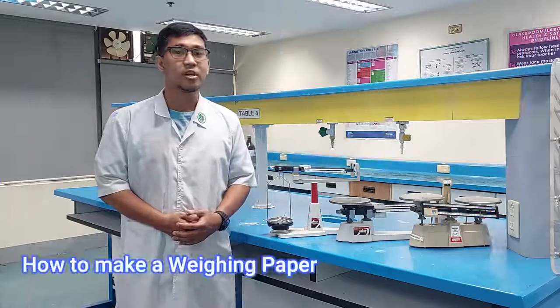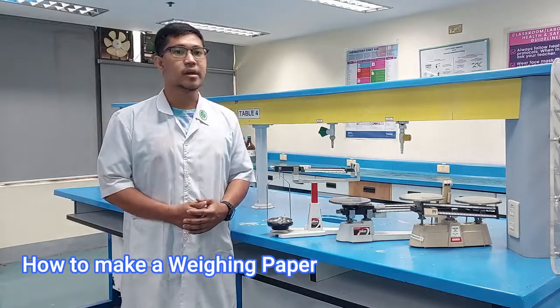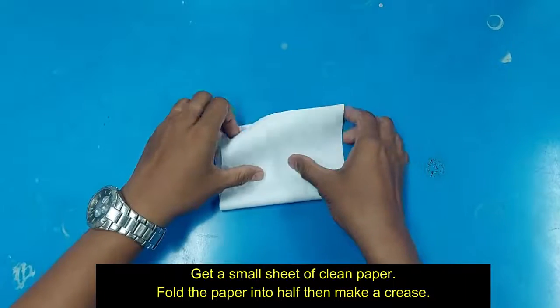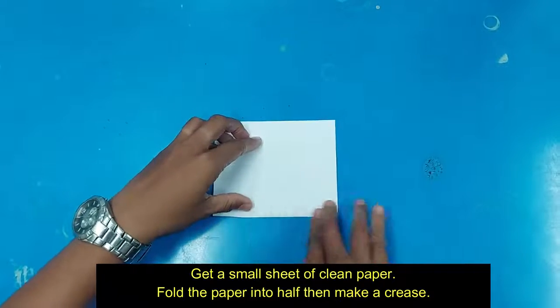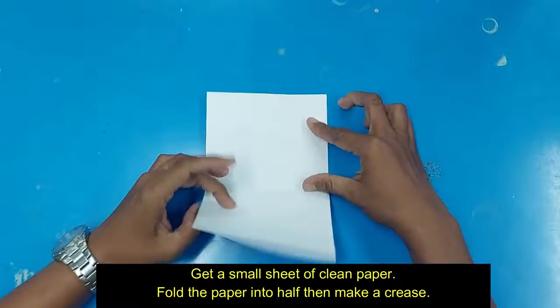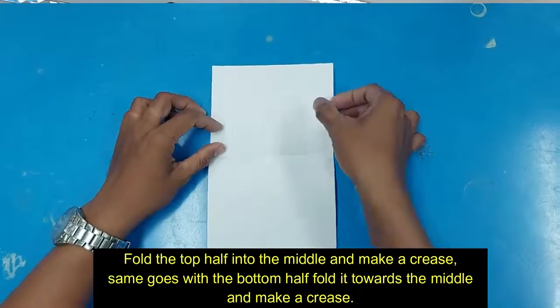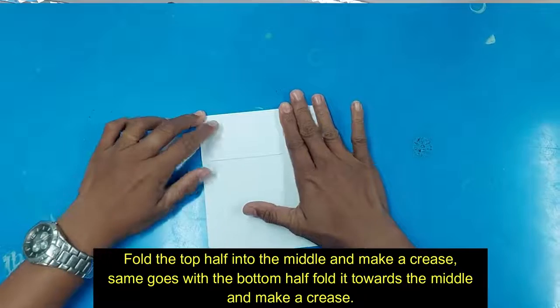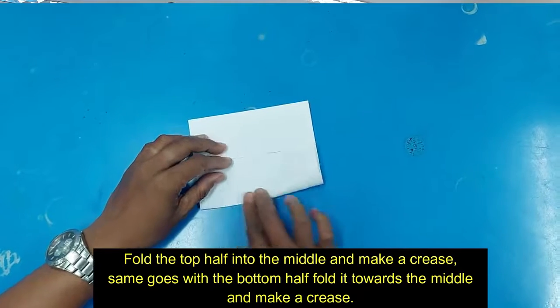In the absence of any weighing vessel for solid substances, you can improvise by making a weighing paper. To do this, get a small sheet of clean paper, fold the paper in half, then make a crease. Fold the top half into the middle and make a crease. Same goes with the bottom half. Fold it towards the middle and make a crease.